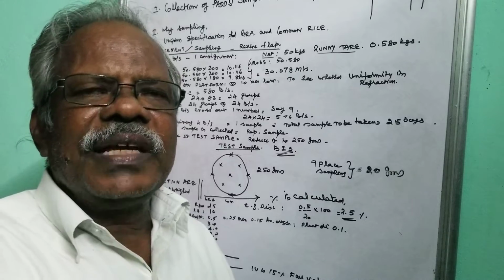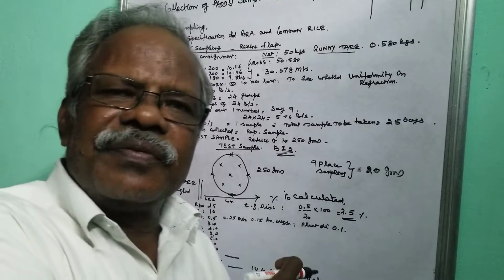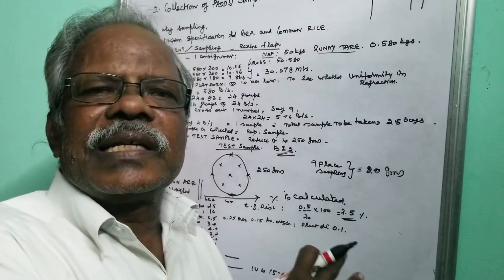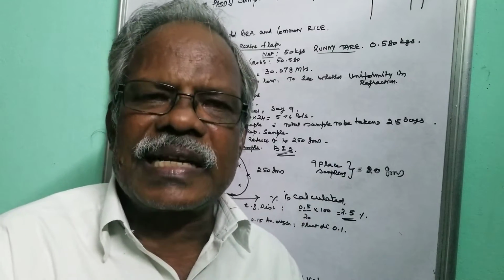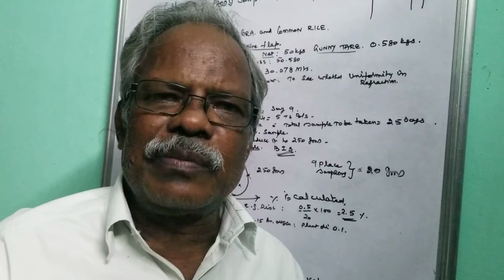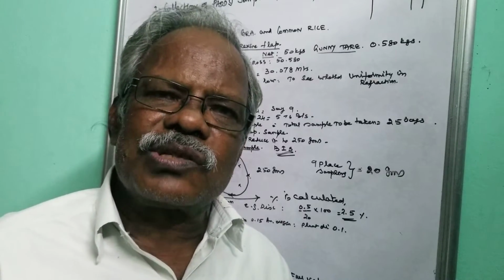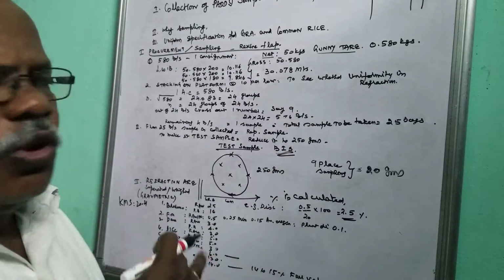By this way we arrive at the percentage, and the percentage should not exceed what is stipulated in the uniform specification. So by this way the procurement is being done. Suppose it is exceeding the limit, then we have to reject that lot, and accordingly the entry should be made, and it should be signed by the party as well as the procurement officer, say technical assistant, and also the manager QC. So these are all the procedures adopted during procurement.